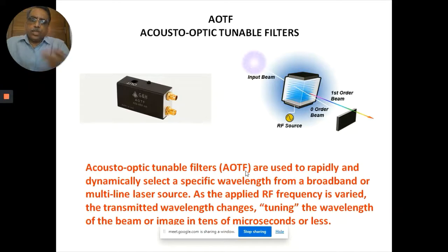You can also do electro-optic modulation, that is also possible. So EOM principles and AOM principles are both used. Mostly for filters, they use the AOM principle. Maybe for the attenuation of the intensity of the lasers, you have the possibility of using an AOM as well as an EOM. But for the filtering action, mostly they go for the acousto-optic tunable filter.